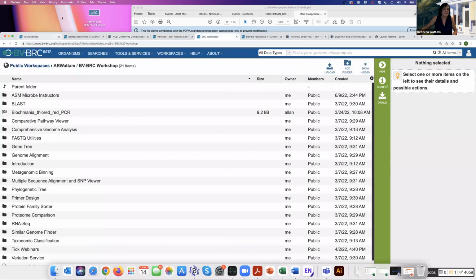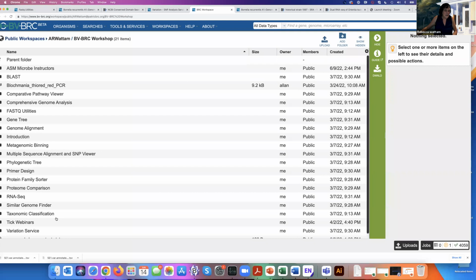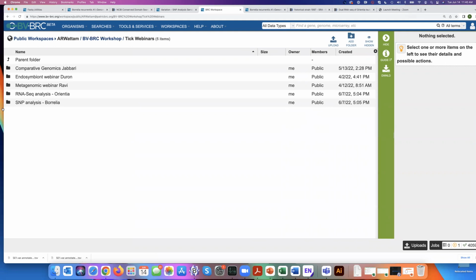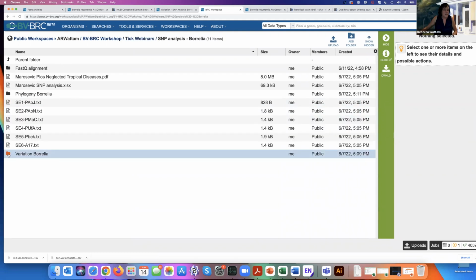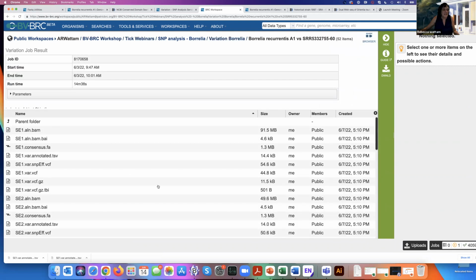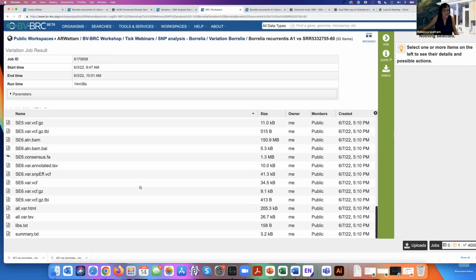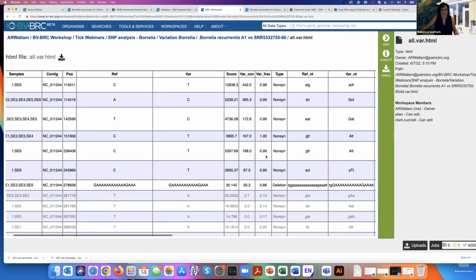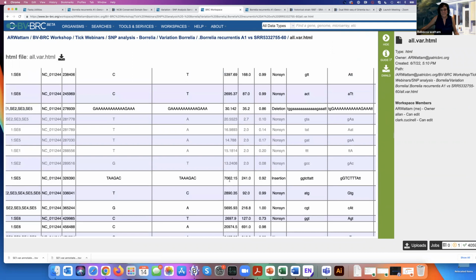It gives you SNPs, MNPs. I'm going to show you really quickly, because I really like this pipeline, so I don't mind showing it. And it gives you large scale deletions, things like that, and insertions. So let's look. Here, it's showing you that there's a big deletion. And here is an insertion.